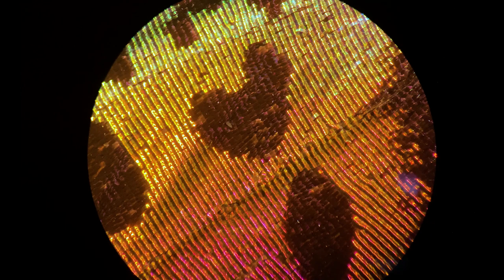These are much shinier. The cool part here I think. See the black parts? The darker parts? Those are also made out of scales. This is my favorite part. It almost looks like a blanket or something like that with that fringed edge. I love that blue color. Here just a little closer.